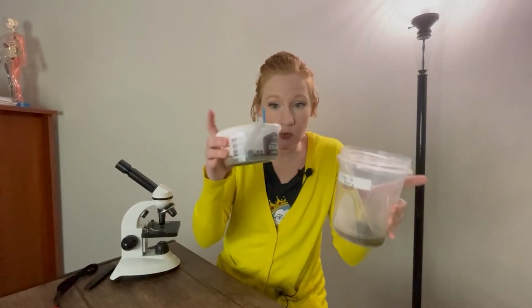You'll need some slides, little glass slides like this, some little slide covers like this. Then you go to a pond with your parents' permission, of course, or maybe with their help. Take a glass jar or a plastic container of some sort.